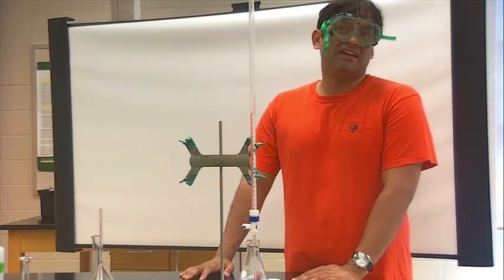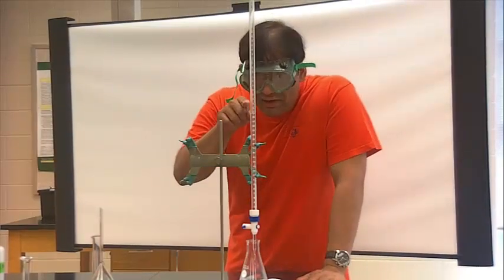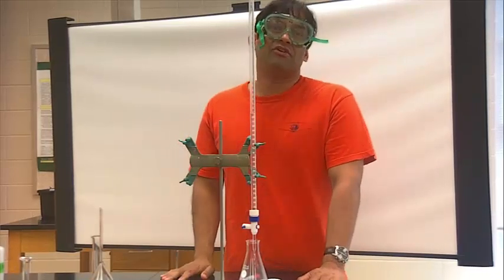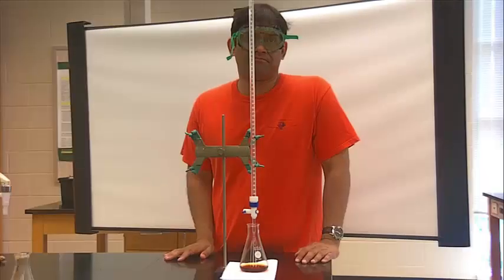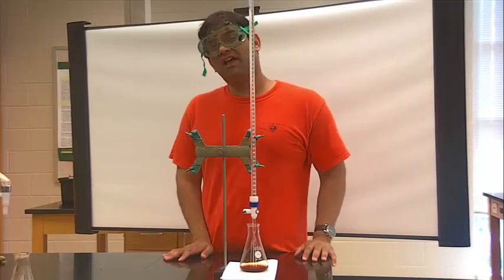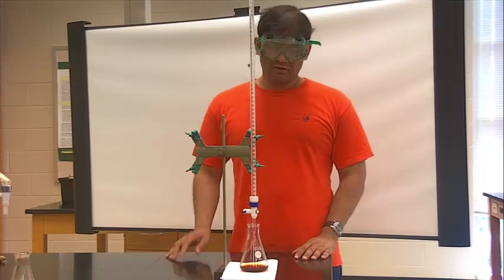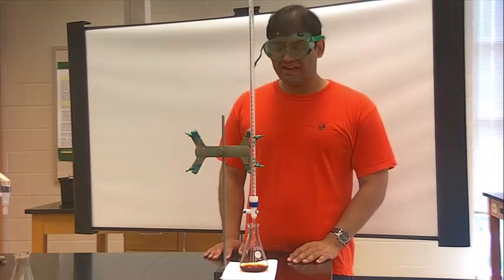Now what will my exact titration be? Everything will be the same, except maybe at around 27 mils or so, I'm going to start going very, very, very slow, drop by drop by drop by drop. So here's my exact titration. I already figured out from my trial titration roughly the equivalence point. So now all I have to do is go 2 mils below that equivalence point.